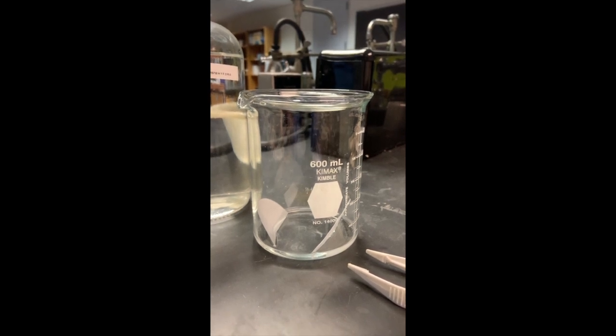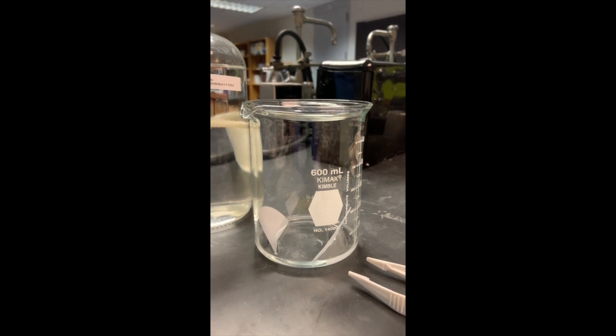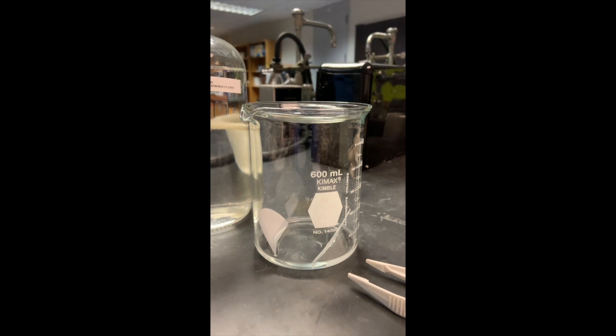So now I'm going to carefully put my TLC plate standing upright, and I'm going to make sure that my solvent does not touch my origin line on my TLC plate.